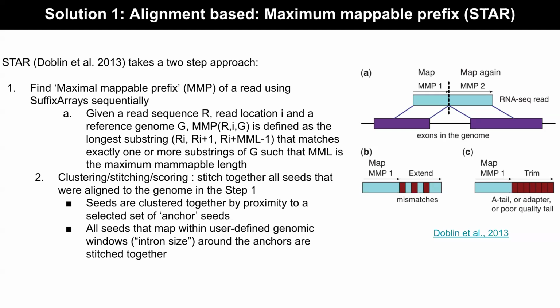So if you take R1, this is your corresponding R2. Now, this is one read pair. You take another read pair which has this portion, this is an overlap. This is R1 prime, and this is, let's say, R2 prime. If you see that this portion also overlaps, then you can put these two together, and then you have that one fragment of the sequence. So it's harder to do this with single-end. It's doable, it won't be that exact, but if you have paired data, this becomes very exact.